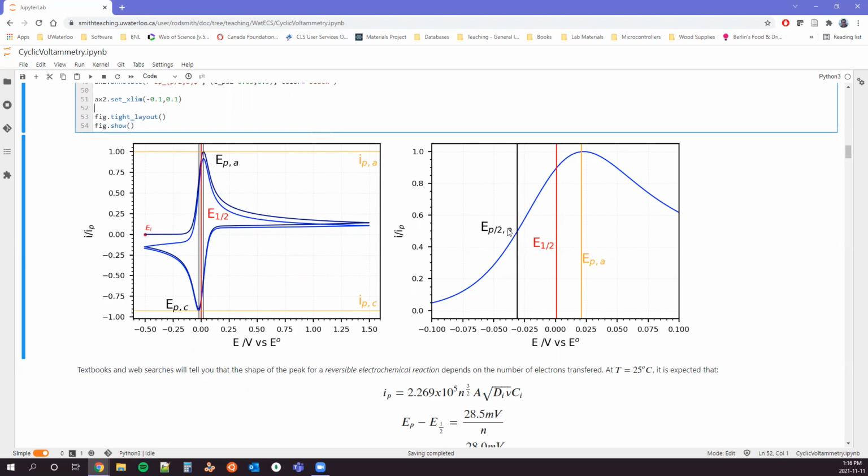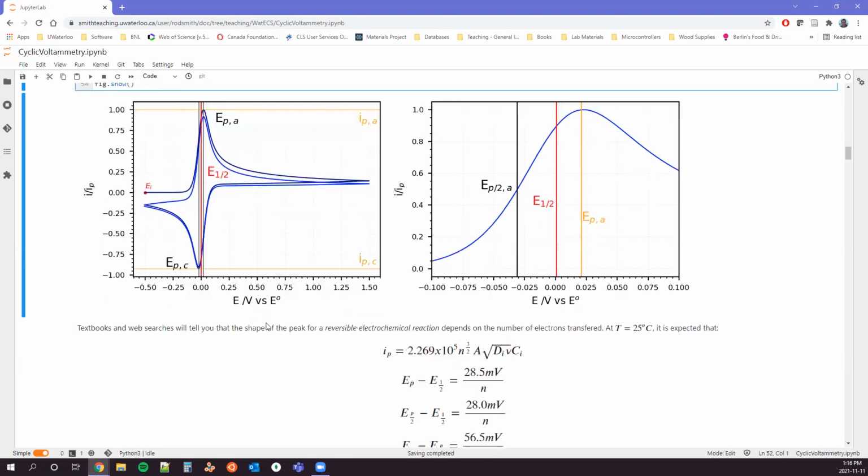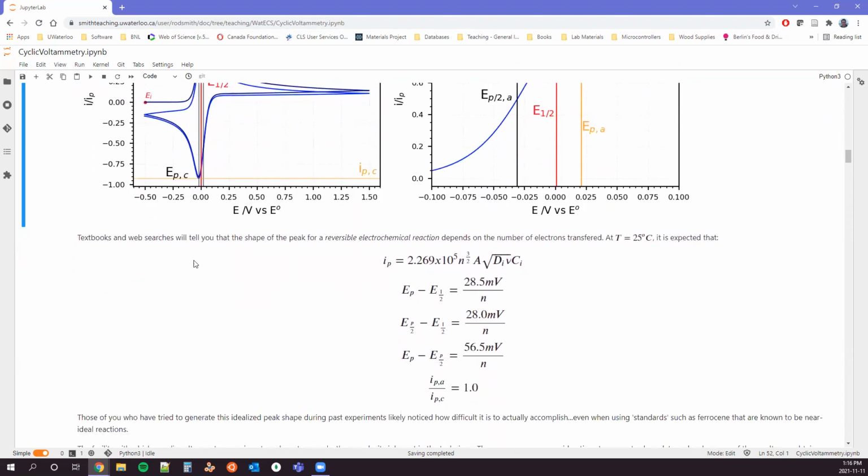And so what this is giving us is the shape, right? And so as we change what's happening in the system, the shape of that peak is going to change. And so this gives us a means to kind of probe that shape of the peak. And there's a number of other types of parameters that we can use as well. So if you've dug through your textbook, probably the Bard-Faulkner textbook, what you'll see is a description of what we expect.